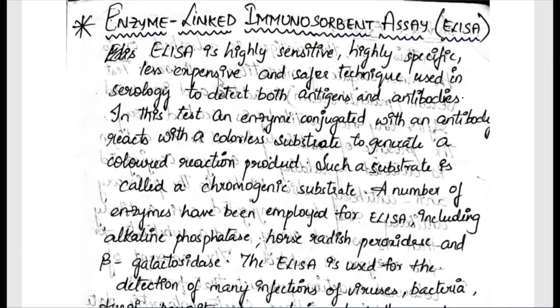So let's begin. ELISA is a highly sensitive, highly specific, less expensive and safer technique used in serology to detect antigens and antibodies. Because of its highly sensitive nature, highly specific nature, and along with it being a less expensive and safer technique, we are going to use this ELISA widely in application.